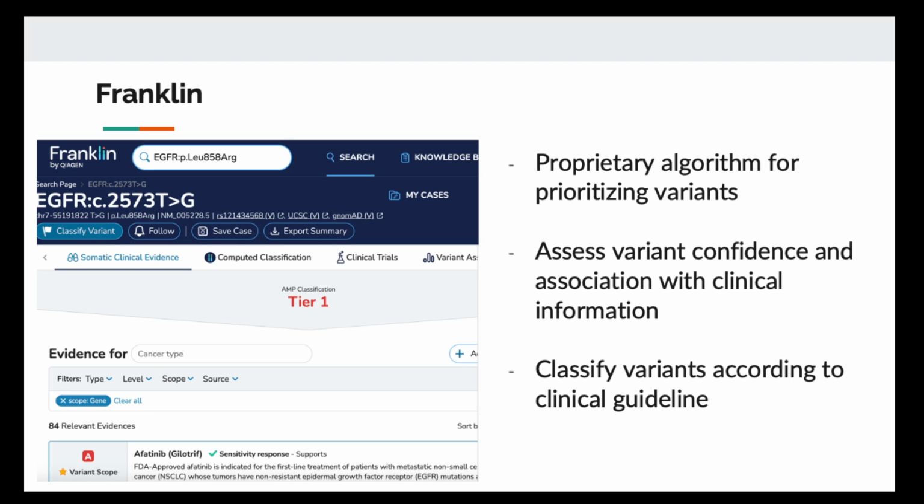Without actually knowing the mechanisms, with enough data, we can make some prediction. This software gathers a lot of clinical data and genomics data and trains models where, if you put in a certain mutation with known disease association or clinical impact, they will rank the severity back to you and provide some explanation of what this mutation does, if they know, and what kind of drug is linked to it. So it's a comprehensive tool that combines all the databases together.